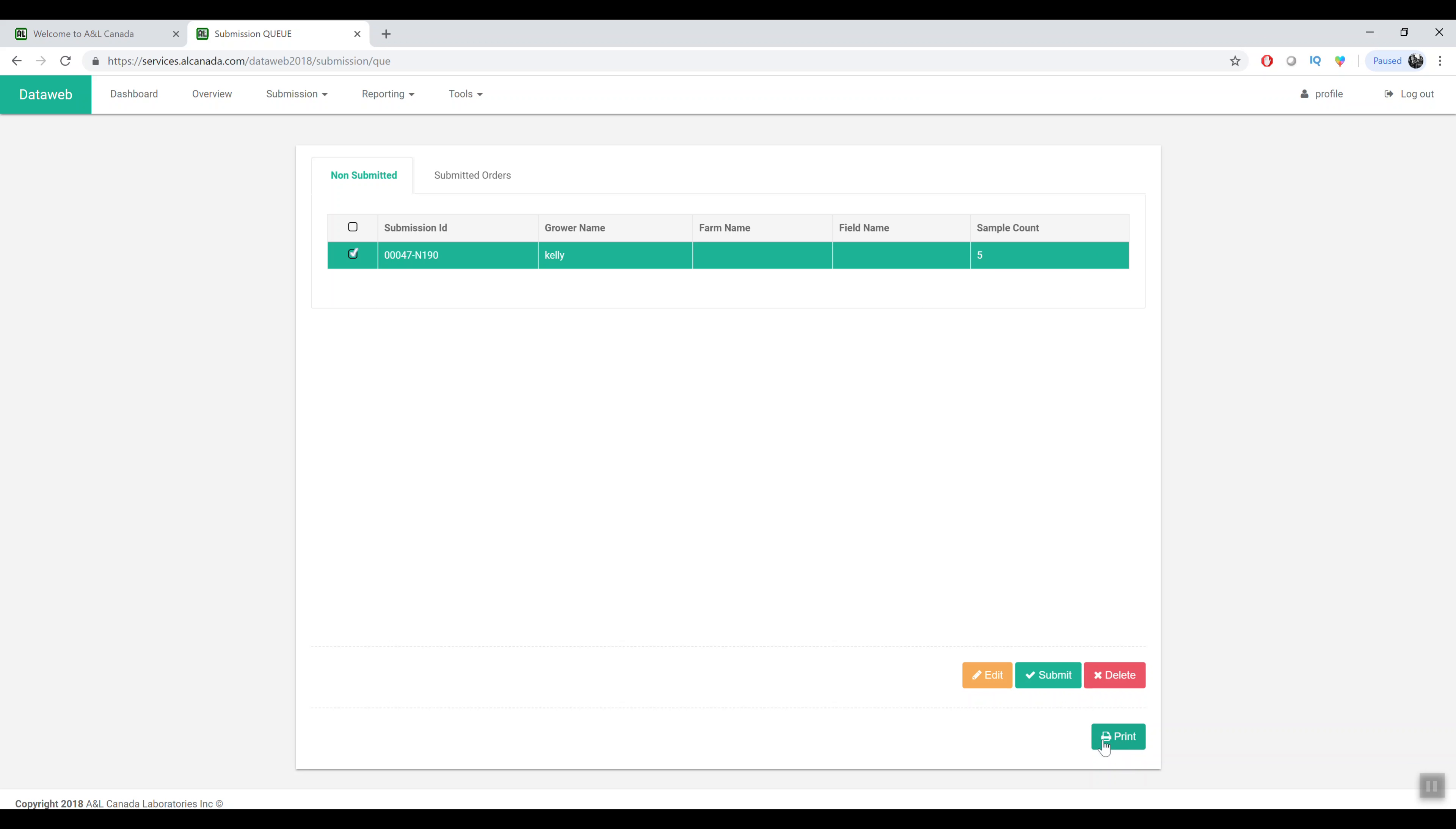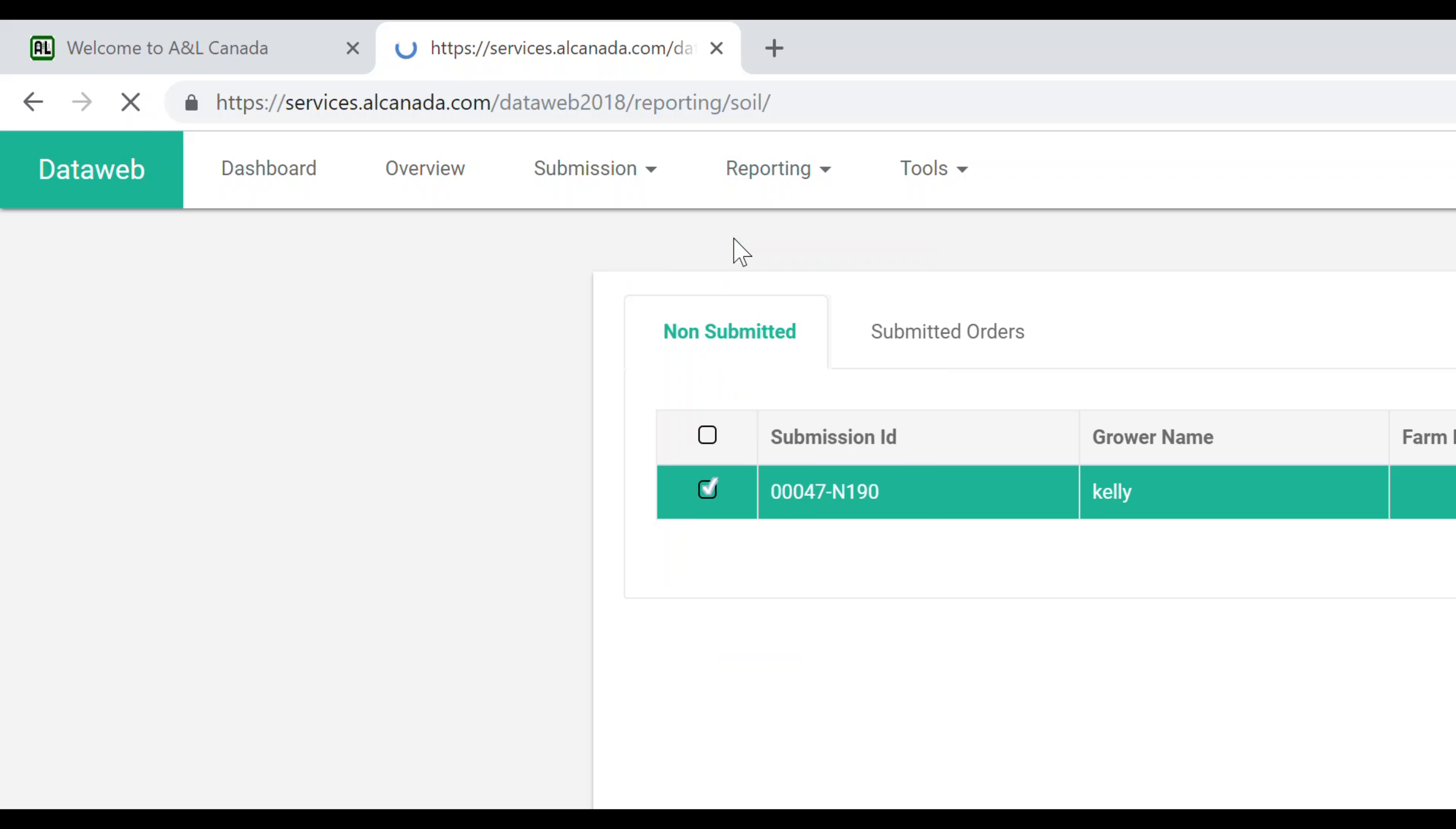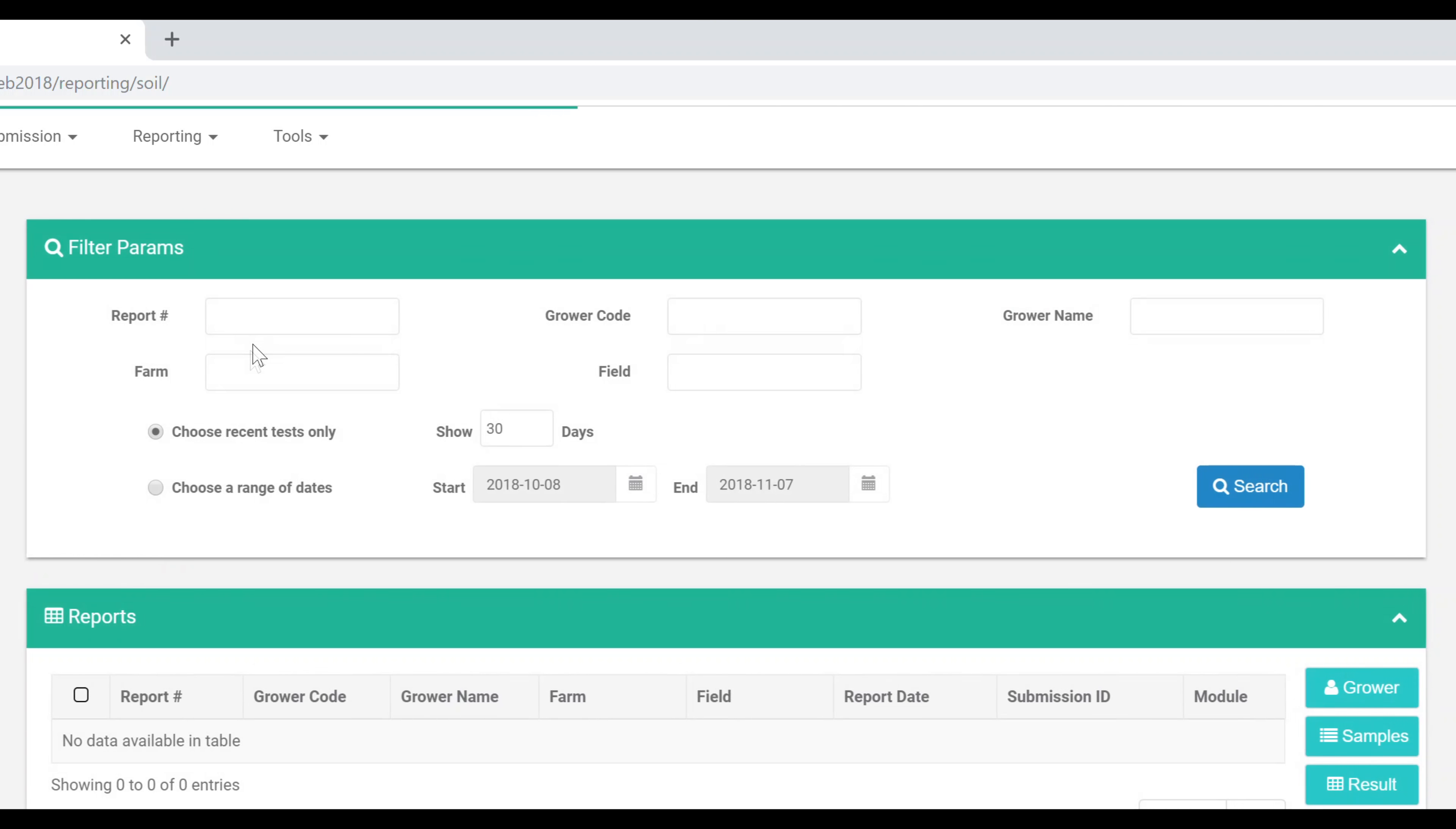Reporting tab is very similar to the current DataWeb. You can search for reports from number of days back, date range, report ID, all that sort of thing.